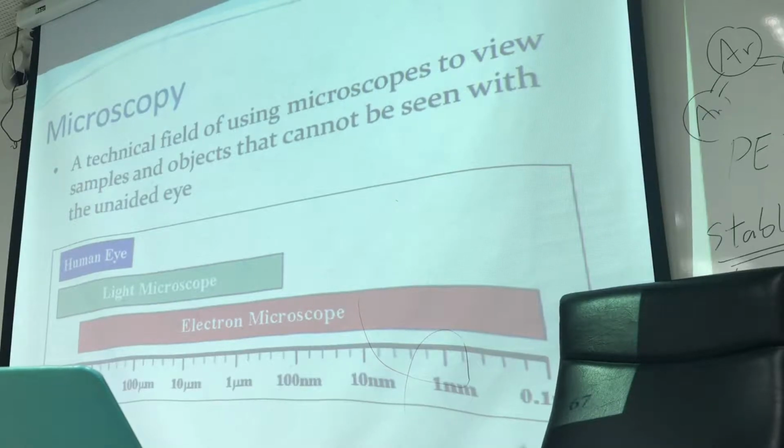Remember? The first microscope is the optical microscope. The second one is the scanning electron microscope. And the third one is the transmission electron microscope. Right? For the optical microscope, what do you have? You have equipment that is quite easy and simple to operate.